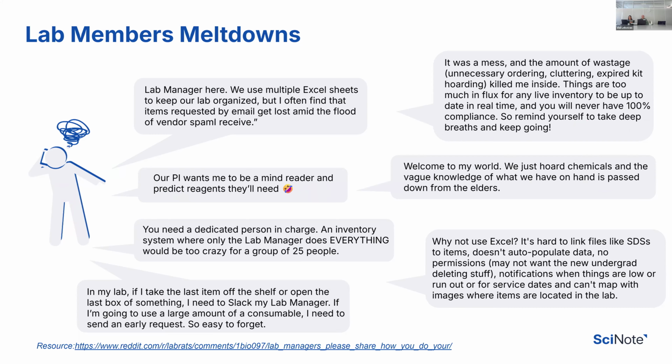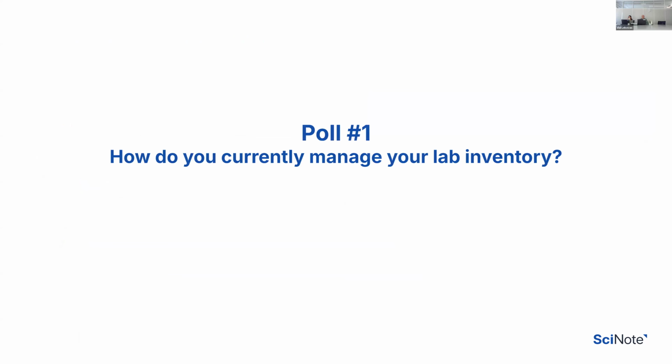Okay, what we're gonna continue with, everyone. We're gonna do a quick poll, same as the last time, because we want to compare the results, and I'm gonna show the results from the previous time afterwards, and also the results from today. The reason why is that usually at the second webinars, we get completely different results. So we want to see if this is true for inventories as well. So let us start the, okay, I think you should already see the poll on your screen.